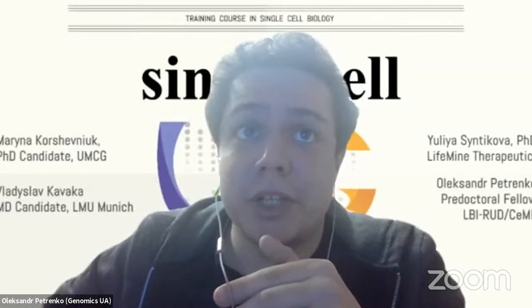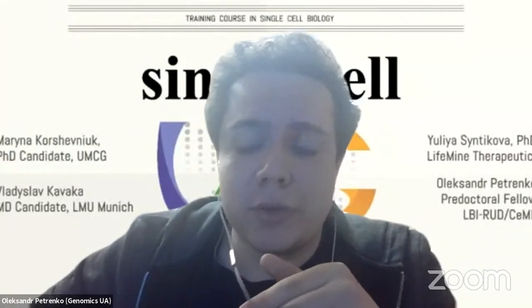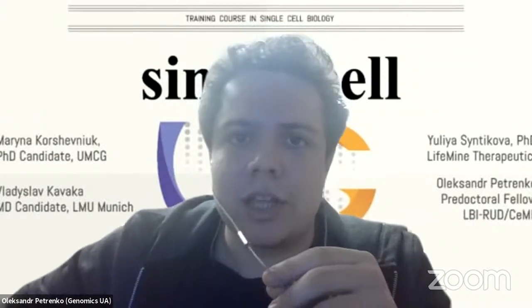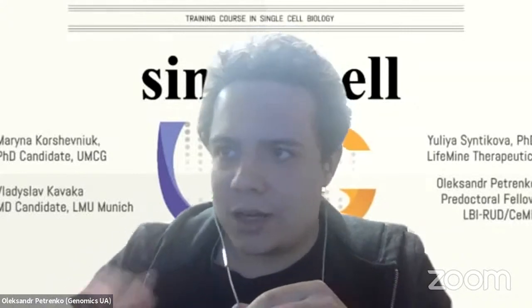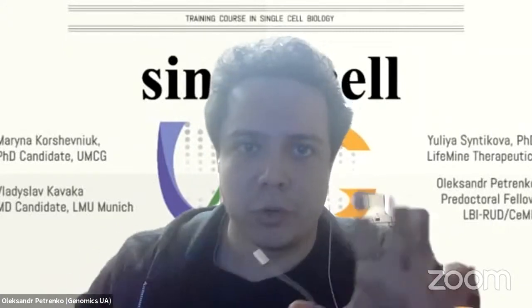The second question was from Andrea. What about the quality control and trimming reads before mapping? Which parameters do we use for that? So for that, it's a very simple answer. It's not Seurat, but it's something before Seurat. If you use 10x Chromium to prepare the samples, after you sequence your sample on the Illumina platform, you'll receive the BCL file, which is the raw data.